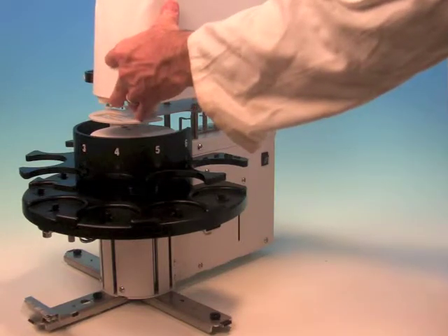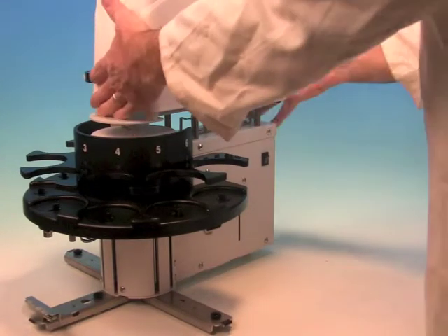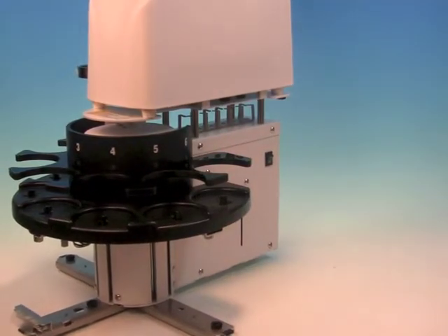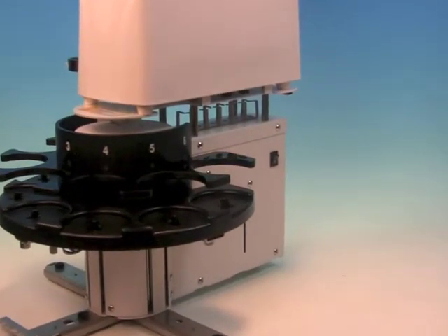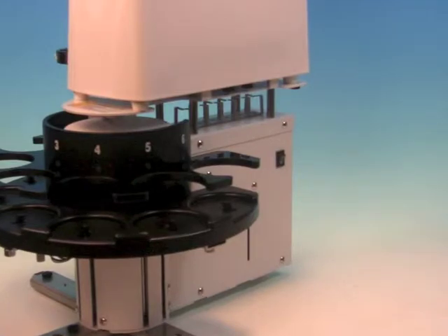The AT700 is designed to sit on top of the sample changer, making it easier for the titrator to maneuver between samples in a compact location.